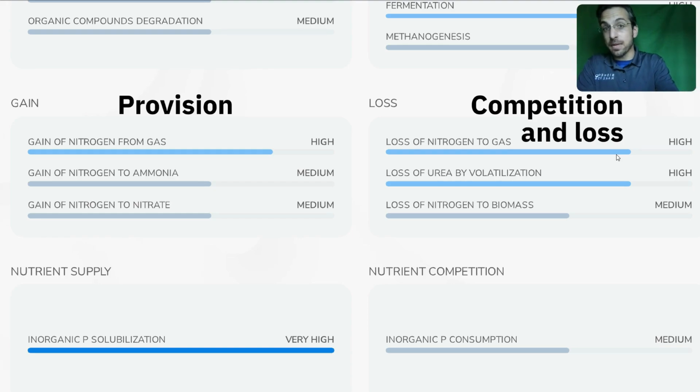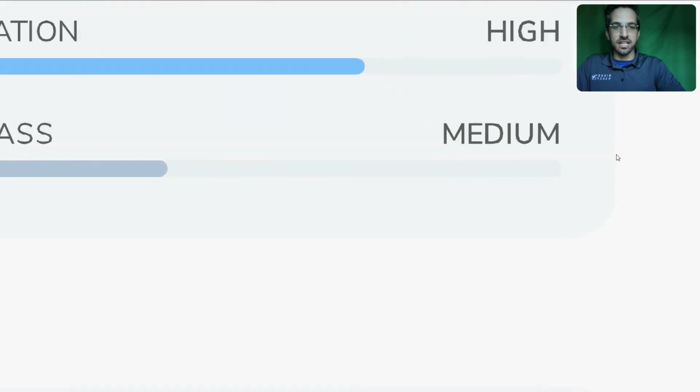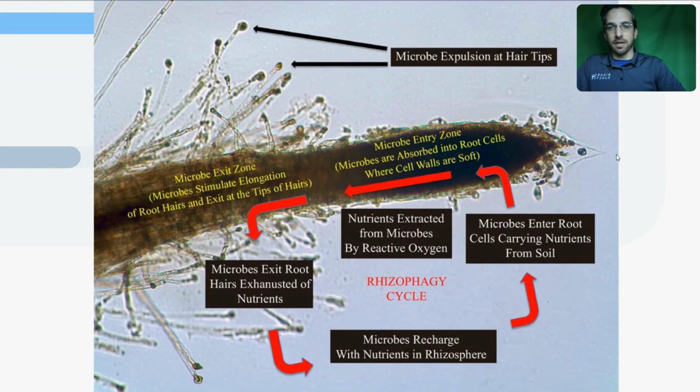That nitrogen is not leaving the system. So in fact, that can be a beneficial pathway, especially if you have sandy soils that are prone to leaching. Nitrogen that is held inside of the little fertilizer sac, which is a microbial cell, is safe from leaving the system. It's not currently available to the plant, but it can be remineralized later on. Meanwhile, it's not leaching, so that at least is positive.